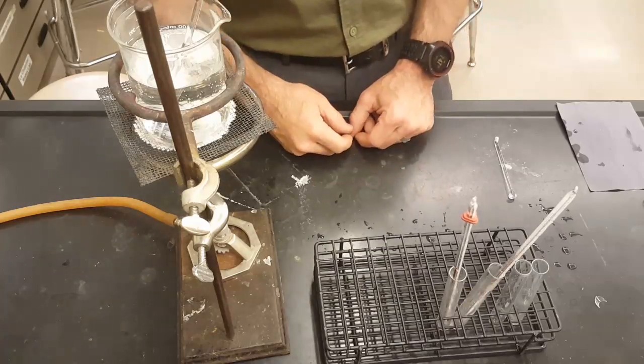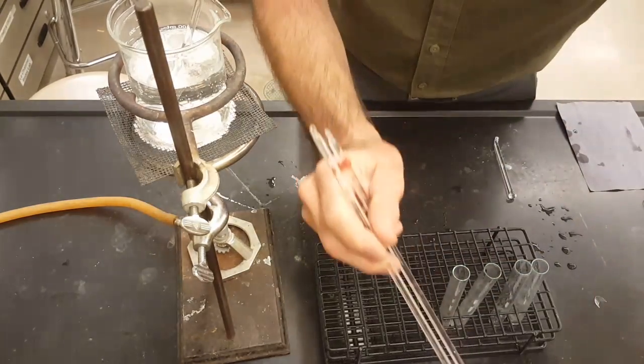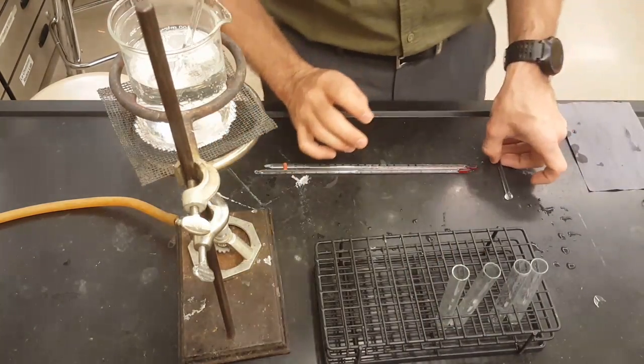All right, you guys, finally we've got cleanup. So for cleanup, take your thermometers and wash them off in the sink. Set them back on your table. You can leave your water right there for next period.